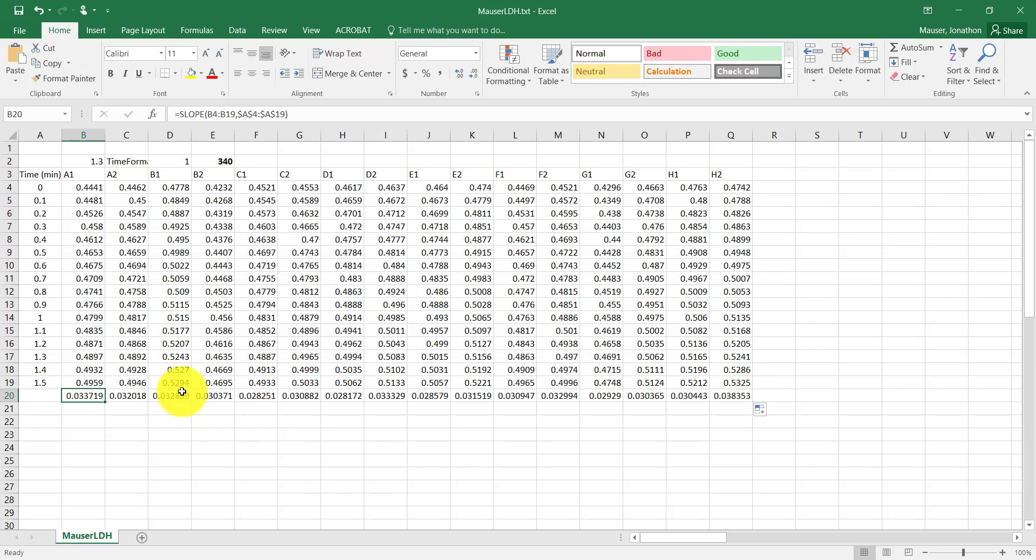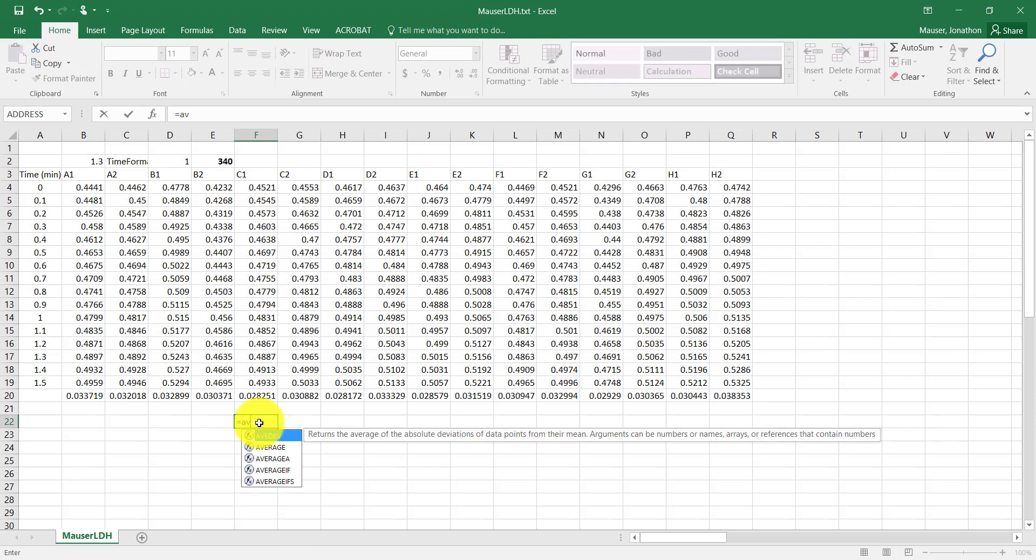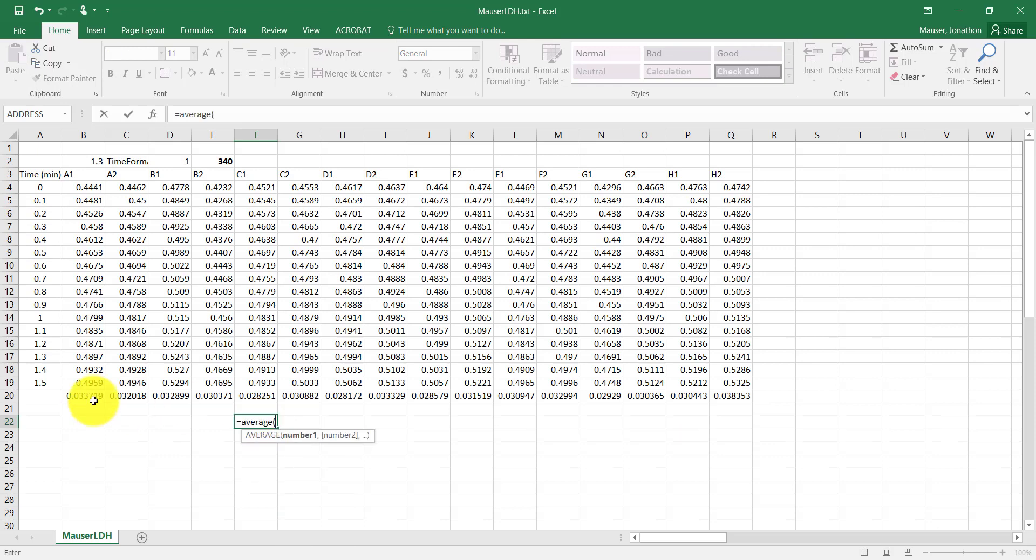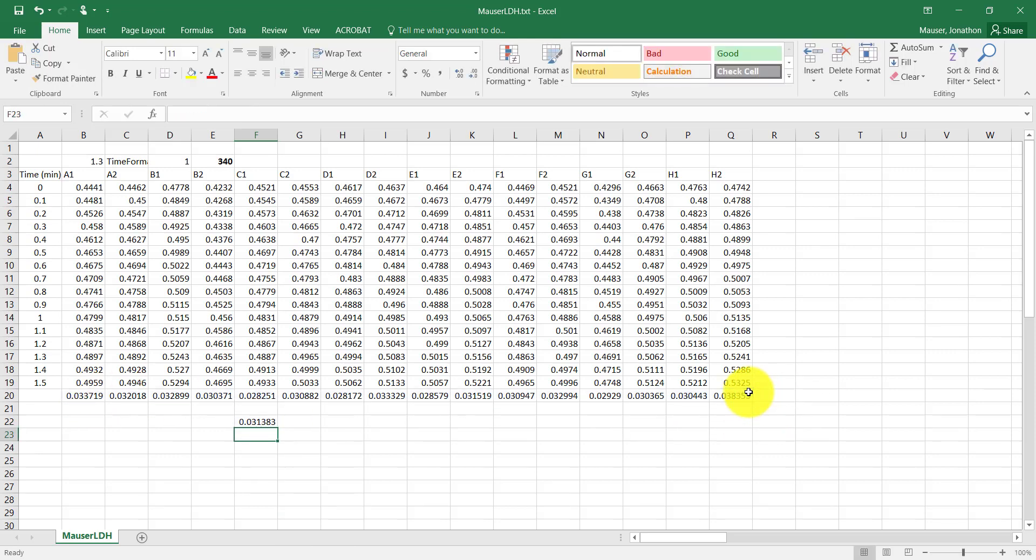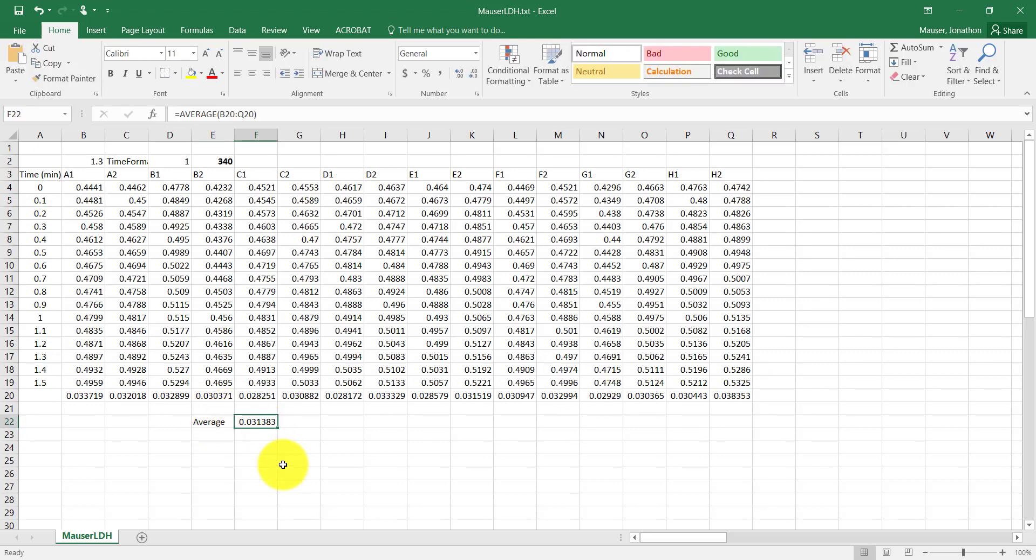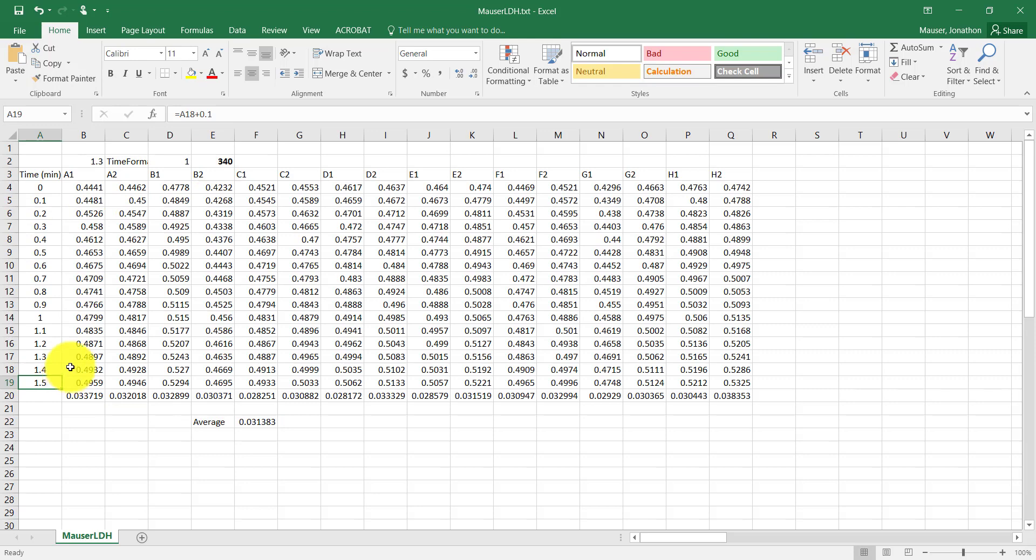And now that's going to calculate the slope for every set of data very quickly. So this is 16 repetitions of the same sample. And so I'm just going to try to get an average of all of those slopes. So my average slope was 0.031383. And that's just an absorbents per minute, correct? Absorbents is here and per minute is over here.